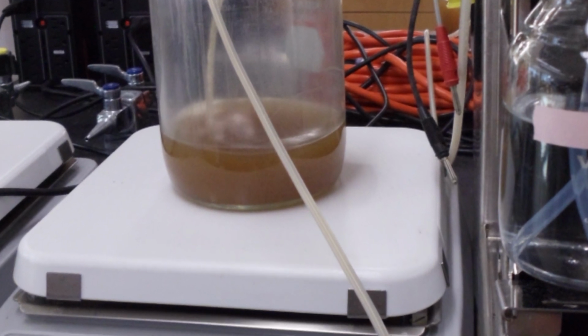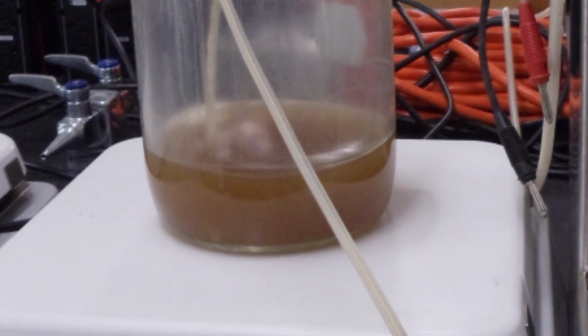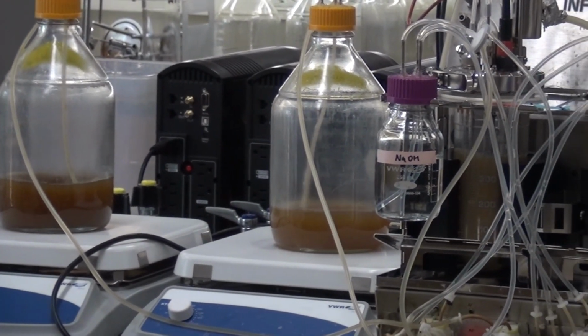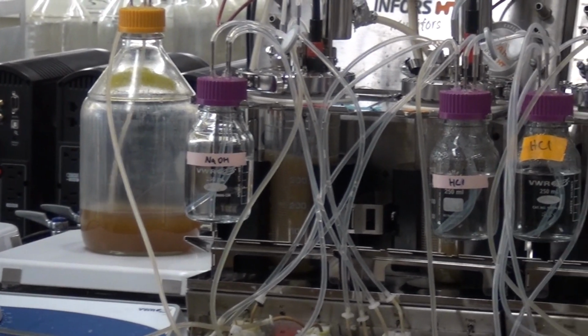The food that we feed the microbes is really, really important. What we do is we have a nice mix of things that are left over after a meal has been digested, and that is put into bottles and into these vessels here at a prescribed rate, and that prescribed rate is the same as the transit time across, in this case, the human colon. We can adjust that to any time that is required, for example, for the horse colon. And this food is passed into the vessels at the same rate waste is removed.